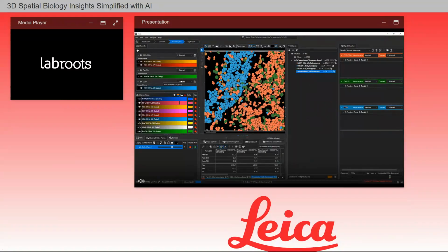This option will pre-populate the phenotyper with phenotypes that correspond to the channel groupings that we have created. When I open the measurement dropdown, you can see that the channels that made up each group are reflected in the phenotype measurement channels, as in the case for the CD3, CD4 group with both channels selected. For teaching, I am going to turn on the ortho slicer again and turn on channel rendering as well.